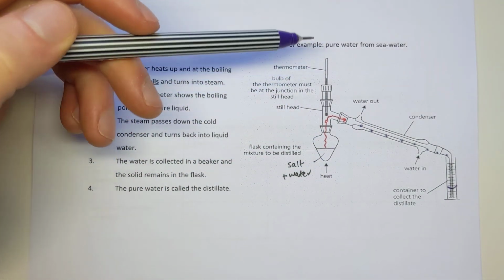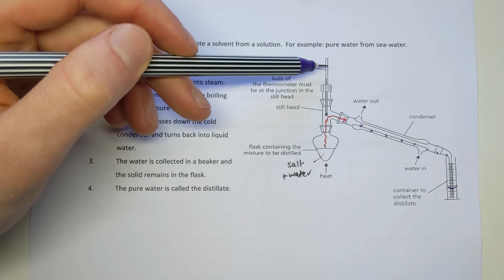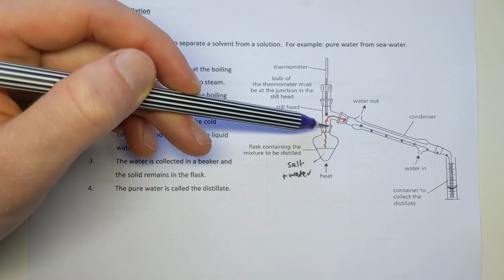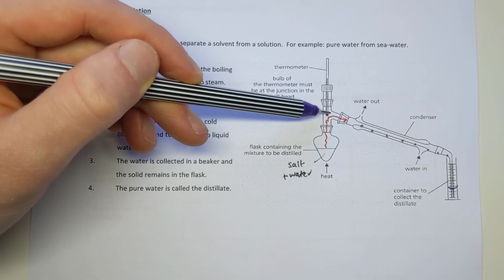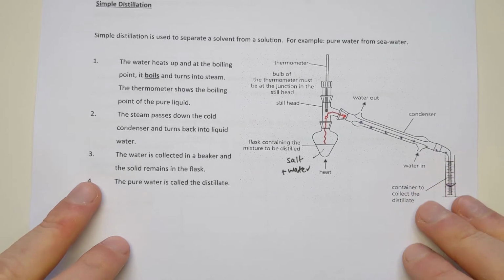The other important part about the thermometer is the position of it. If you're asked to draw it or identify maybe a mistake in the drawing, the thermometer should be at that low position where it's just where the steam is going into the condenser. If it's too low, I'm not getting an accurate reading about what's going into the condenser. If it's too high, it's not accurate either. It needs to be at the position just as it's going from this container into the condenser. So distillation, getting a liquid back from a solution, it's two processes. You boil it, then you condense it.